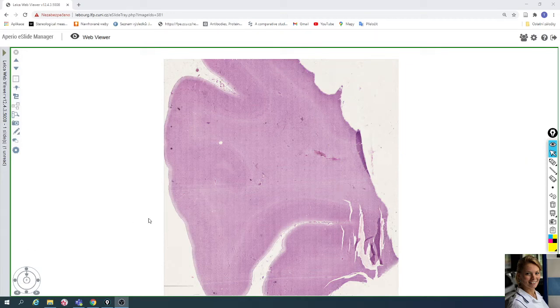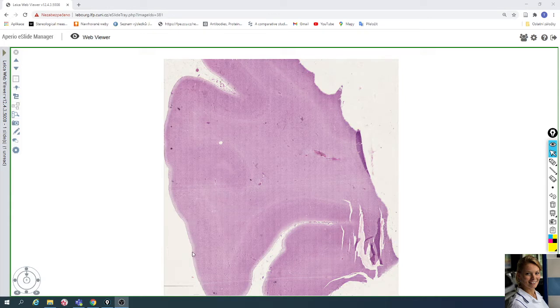In this video we will take a look at the slide of cerebrum. The slide is stained with hematoxylin and eosin. The cerebral wall creates gyri. Here you can see one gyrus and sulci. Here is one sulcus and a second sulcus.